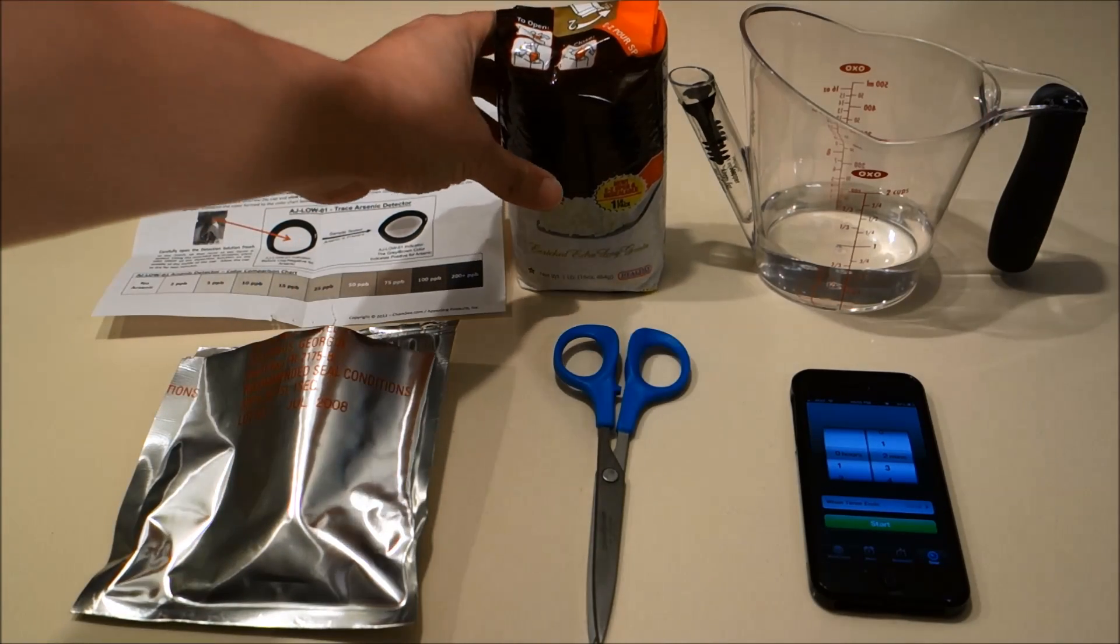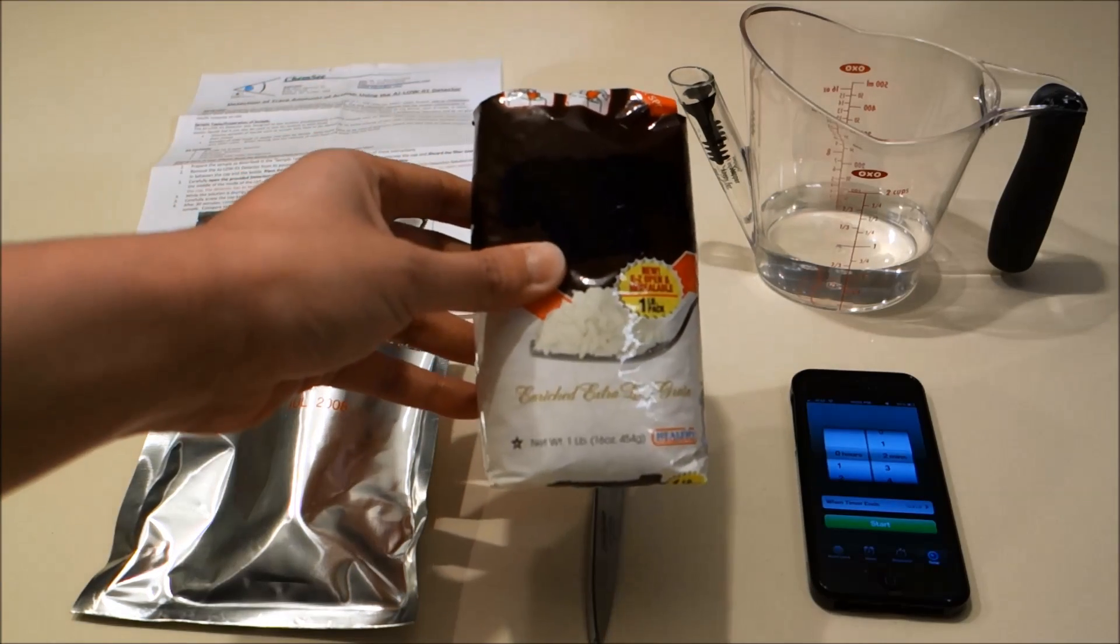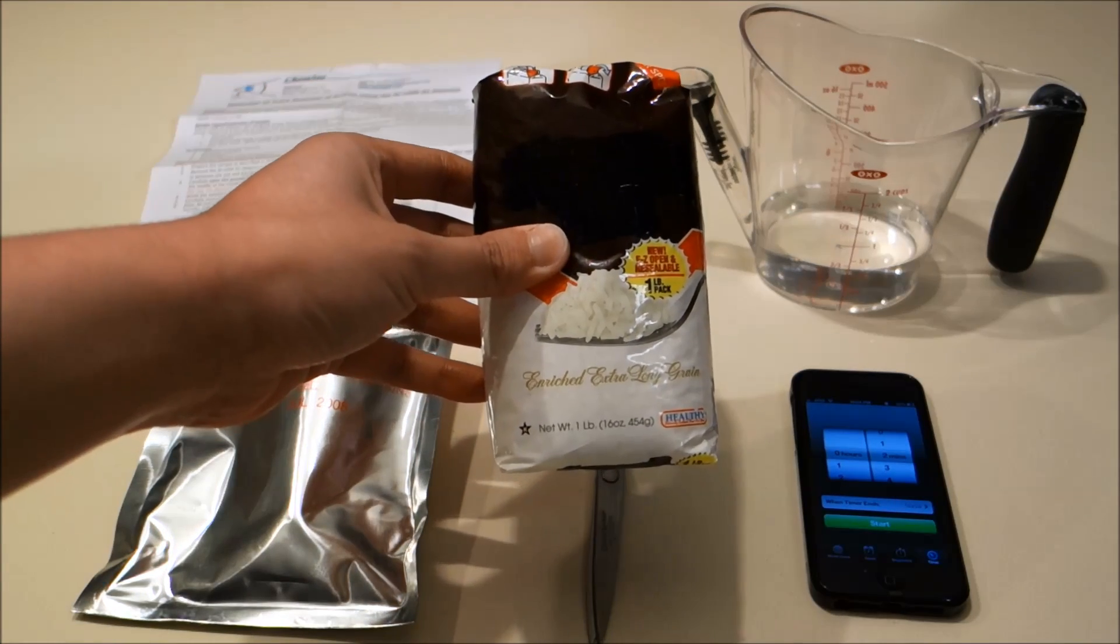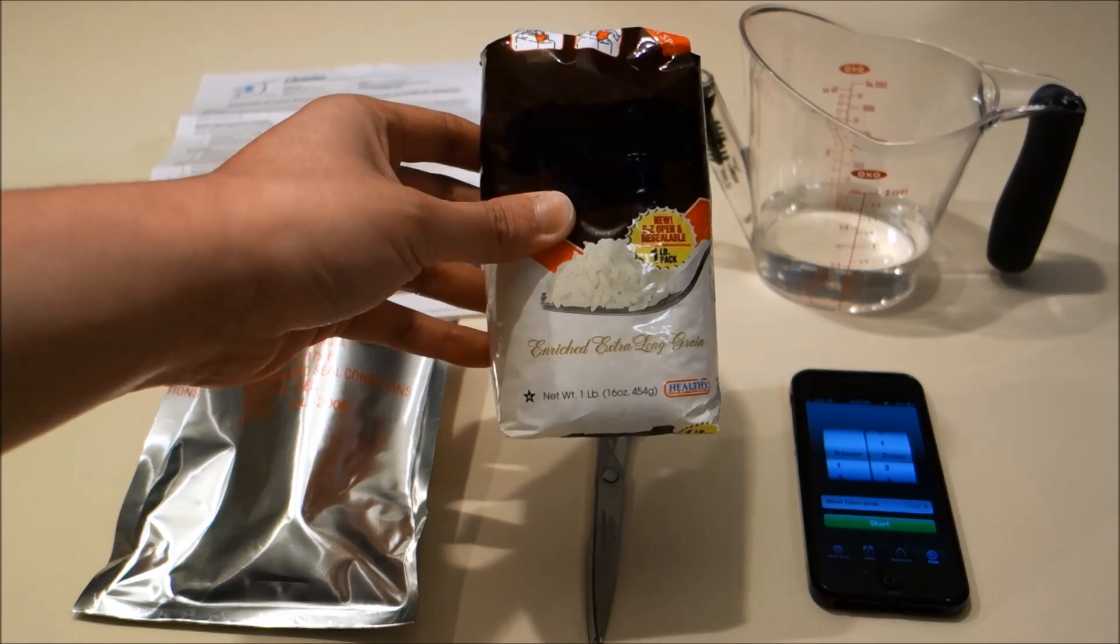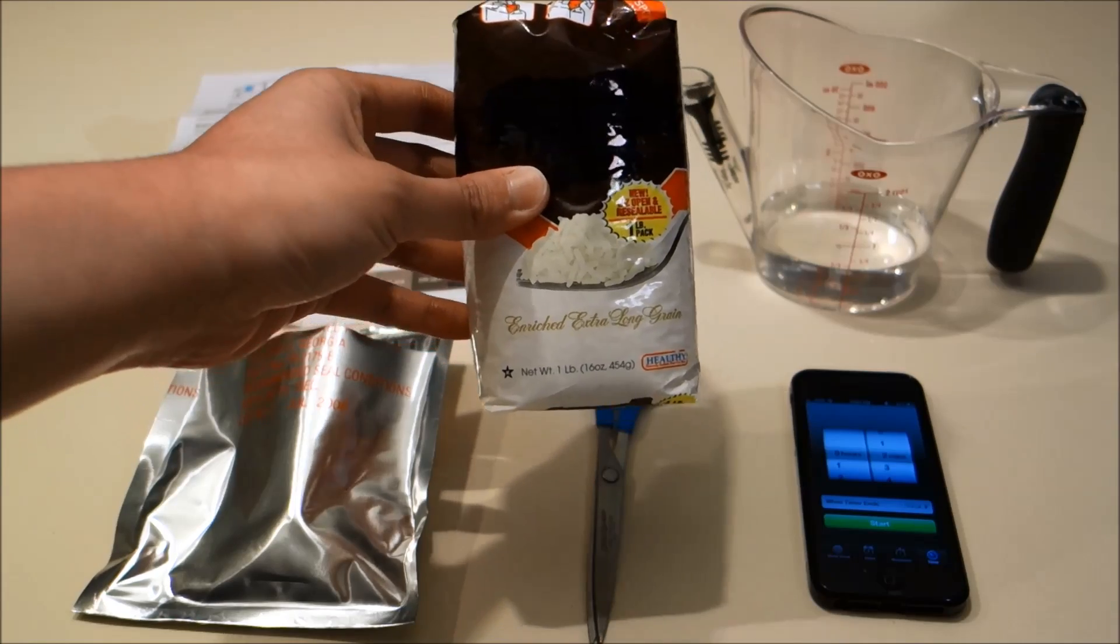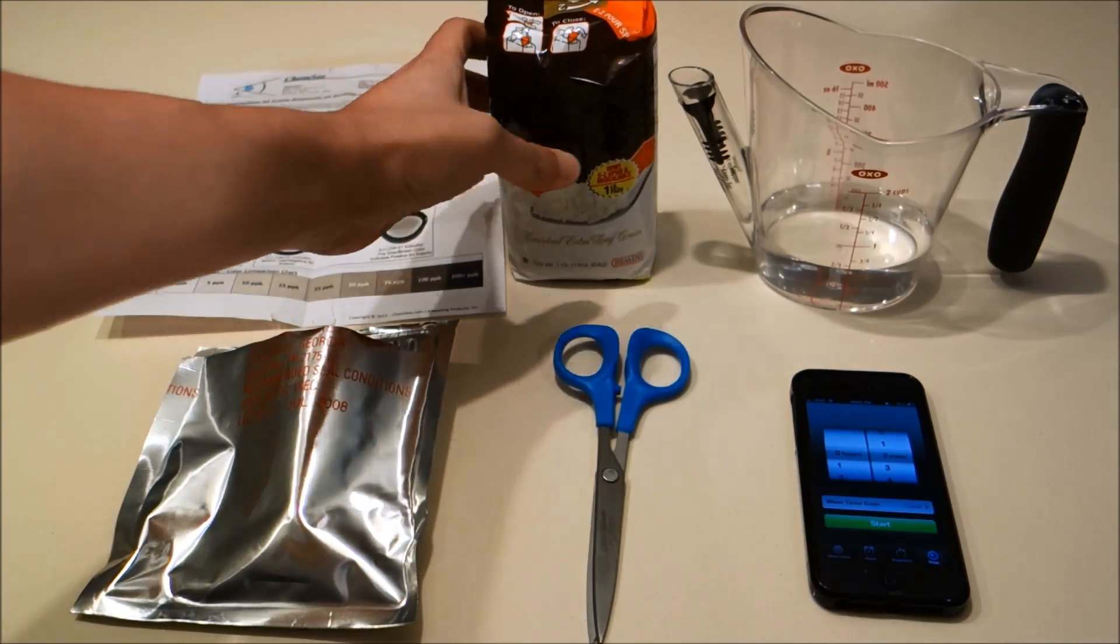Now we're not showing the rice brand here, but it's a common brand made with American-grown long grain white rice available at a supermarket chain in the United States.